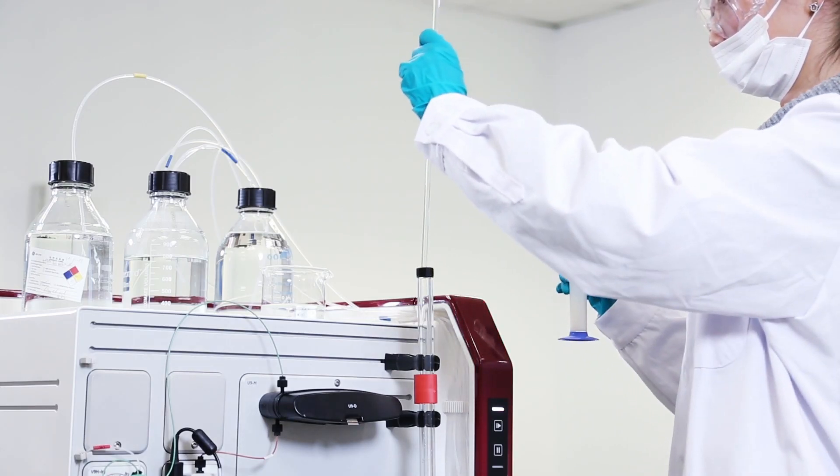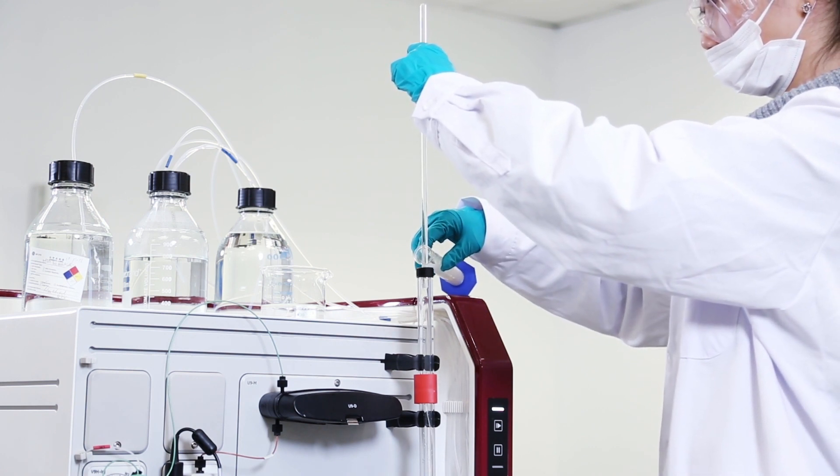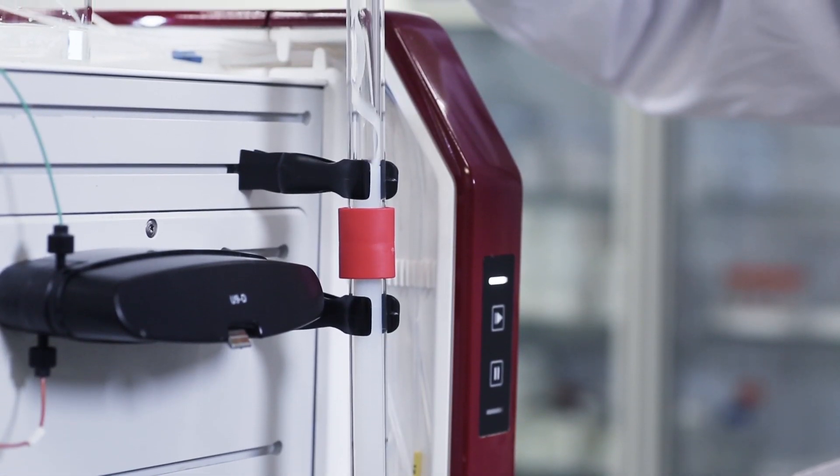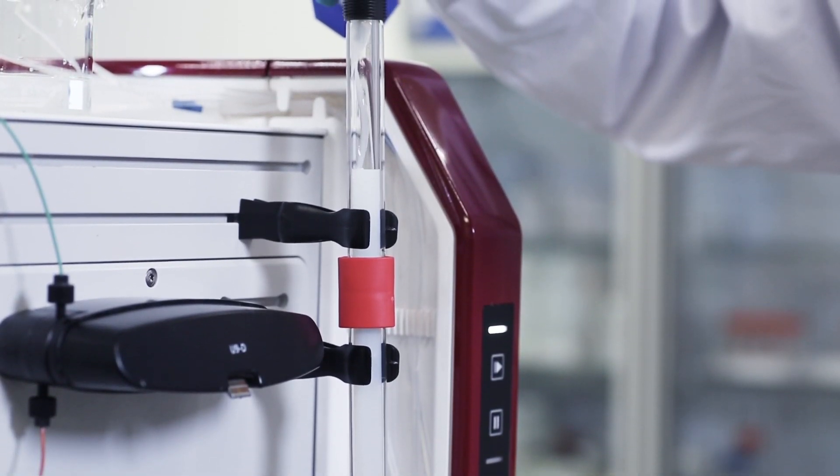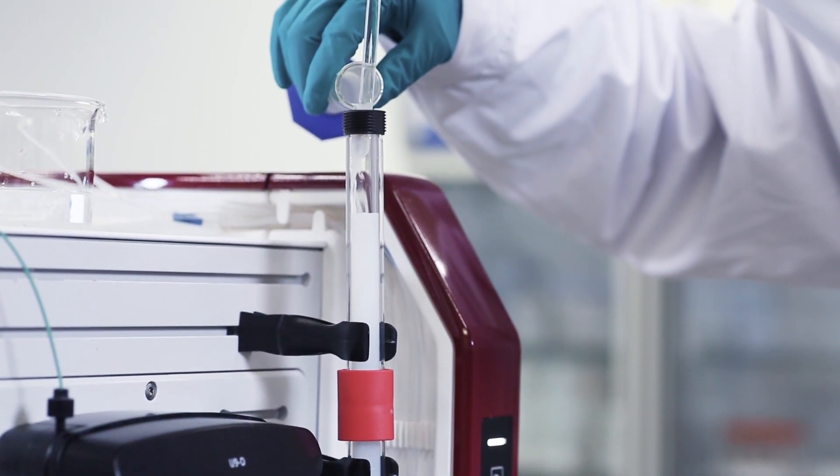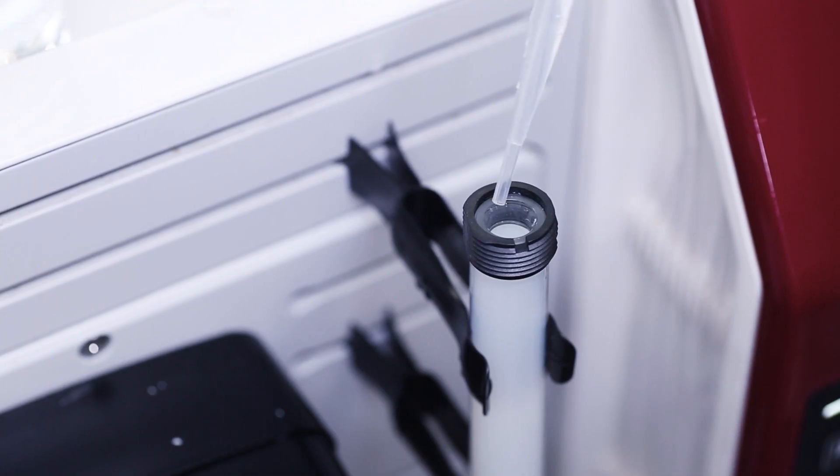Begin packing the column by remixing the resin slurry to ensure homogeneity. Pour the slurry down a glass rod or spatula held against the wall into the column. This will minimize the formation of air bubbles. It is crucial to pour all the resin at once without stopping.